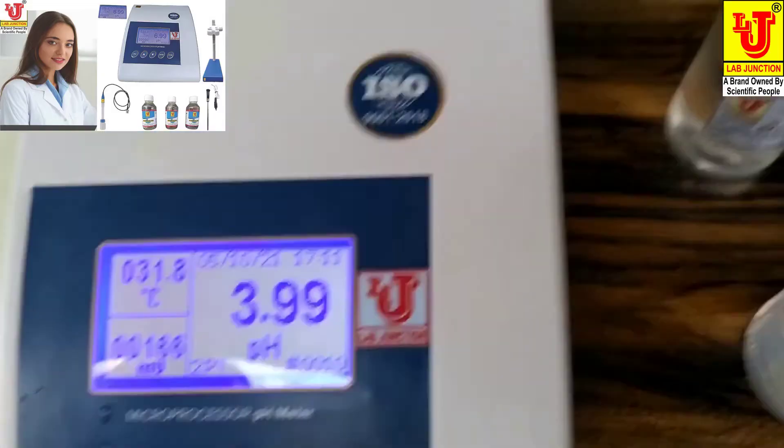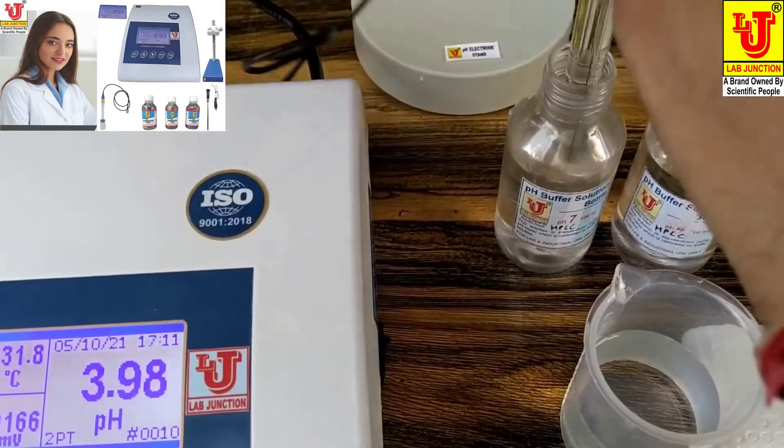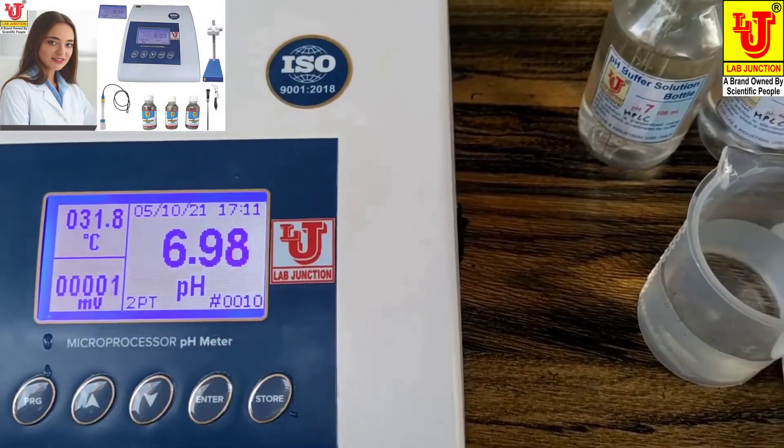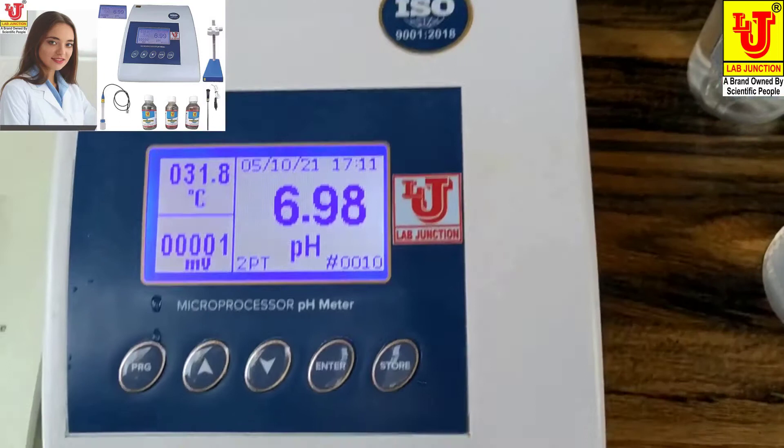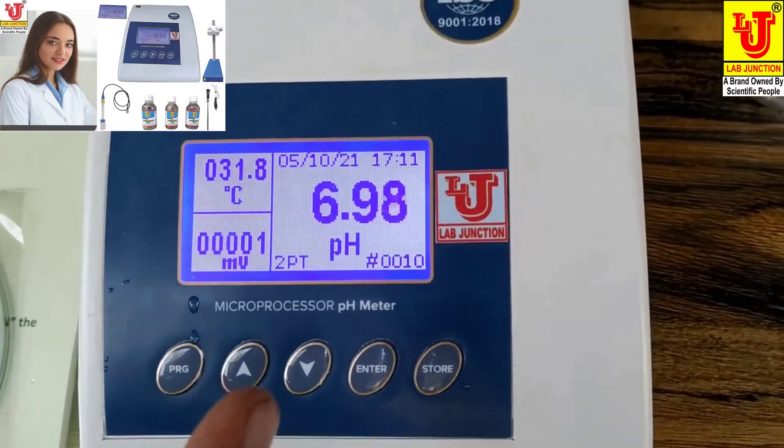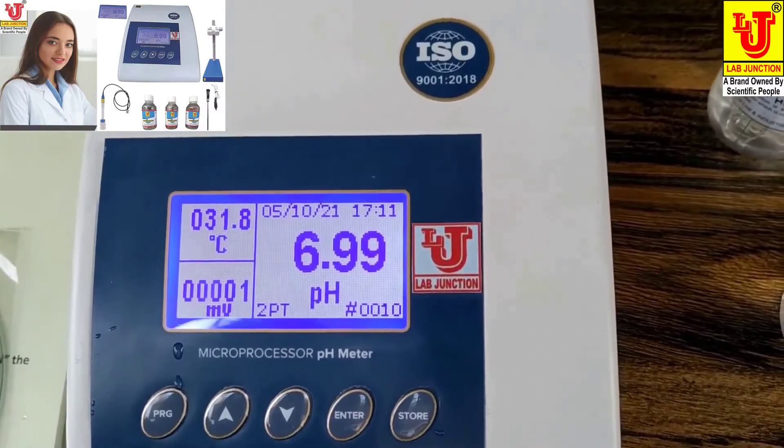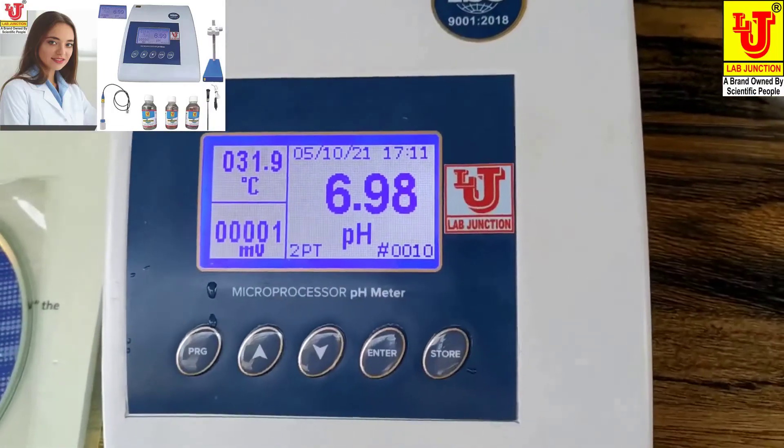Now go to main menu. 3.99 for 4 pH. For 7 pH, this is the final value of 7 pH, 6.99. This is a very simple microprocessor pH meter.